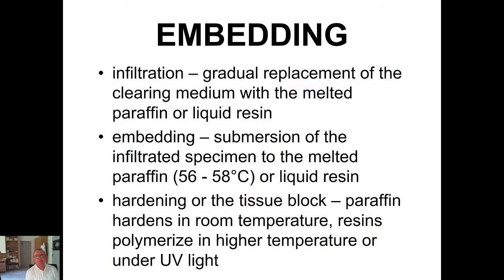Paraffin block is hardened very simply by cooling in the room temperature. Resins are usually polymerized in special ovens by high temperature or under UV light.